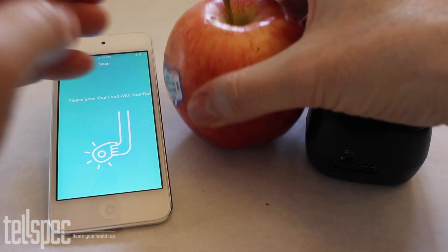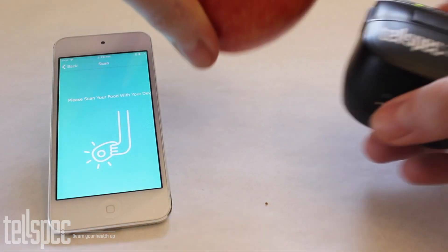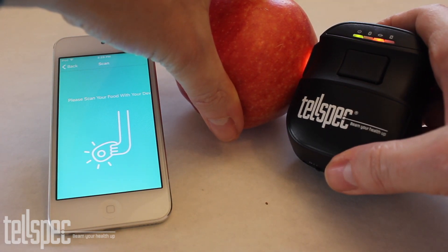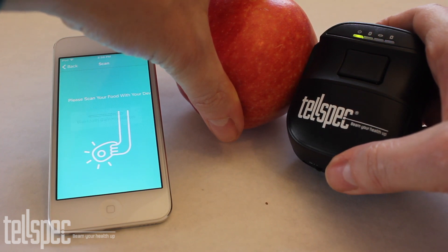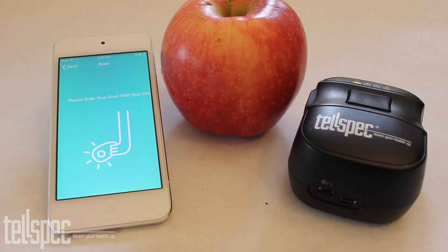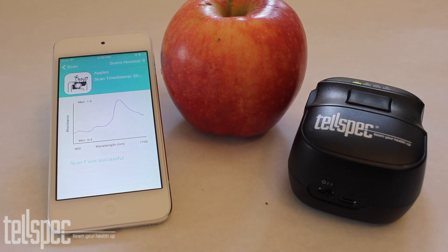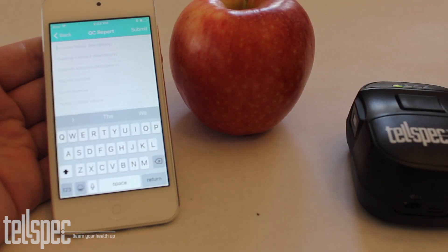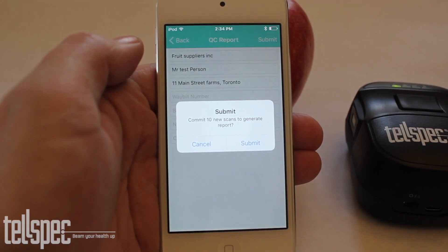Now we're going to scan this apple. First we take a scan like we did previously with the other apps. The information is sent from the scanner to the mobile phone via Bluetooth, and from the phone up to the cloud where it is analysed. After we have scanned 10 different apples from the same batch we can now generate a report.